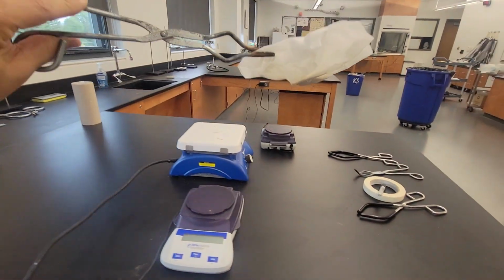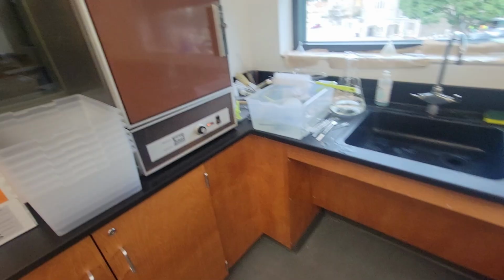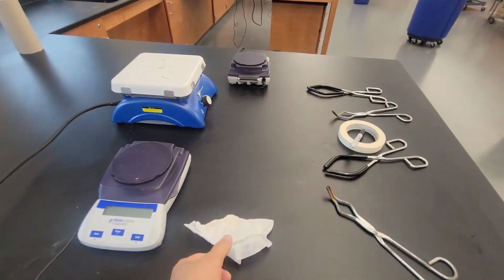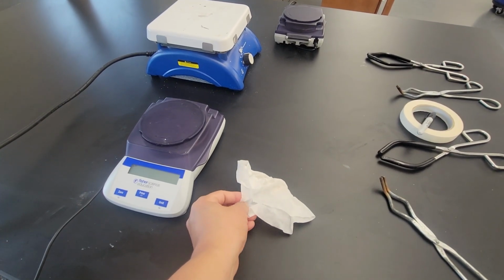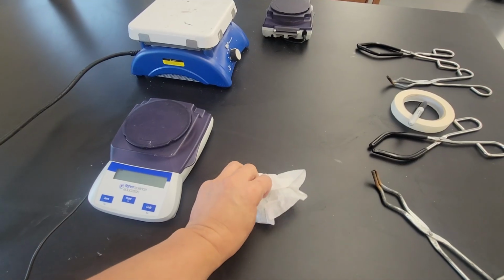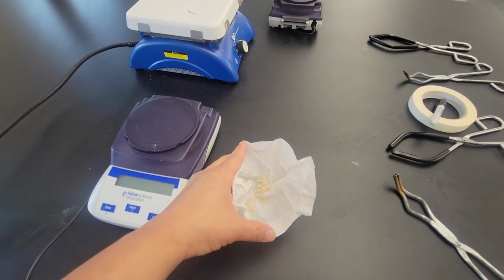All right. What I should have done was zero out my filter paper. Nice and dry. Now let's go weigh this.